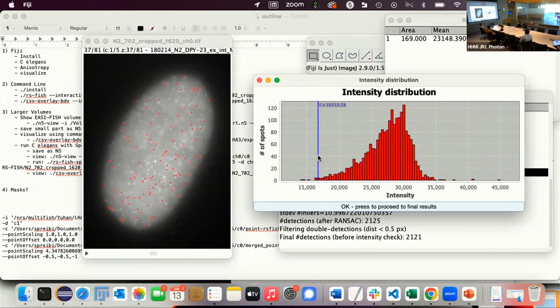It's really evil, actually. The MATLAB tools, for example, have offsets of 0.5 pixels in X and 1 pixel in Z relative to the Python and Java-based tools. Well, it's always fun. That is really evil. There's a little chapter in our paper about this, how each of them does it.